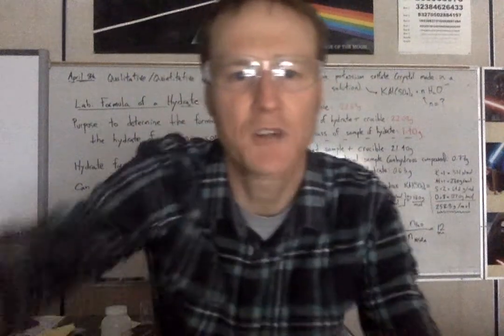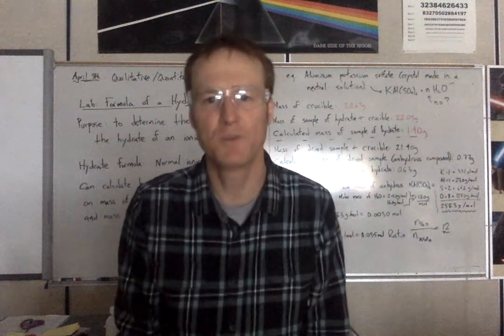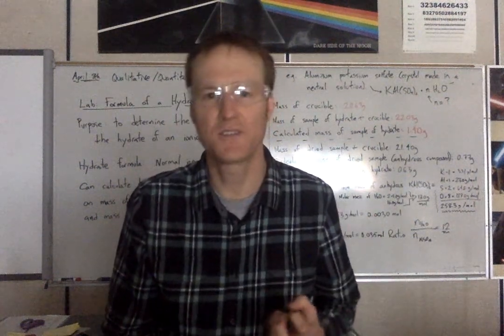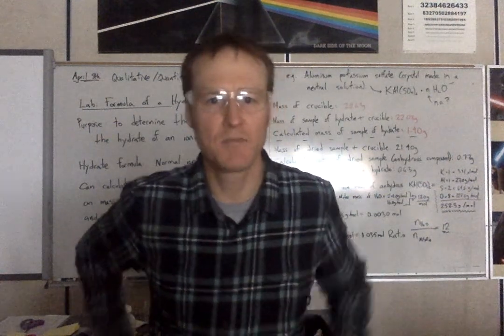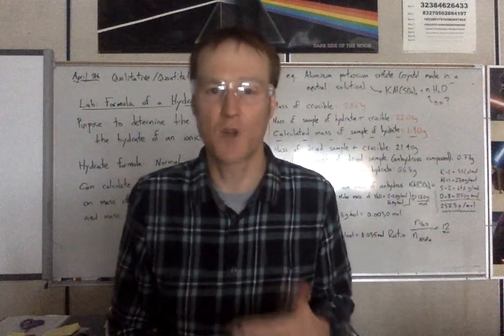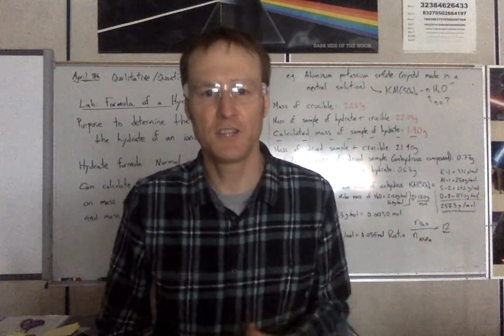One thing that transition metal salts, or many metal salts, often will do is that when you expose them to a flame, a high heat, tiny amounts of those ions will escape into the air, and they can then actually release light. They're very excited ions. Their electrons jump back down and release light of a characteristic wavelength. For copper, that wavelength is the wavelength of blue or bluish green light. And so when you flare copper salts, you tend to see a green color.